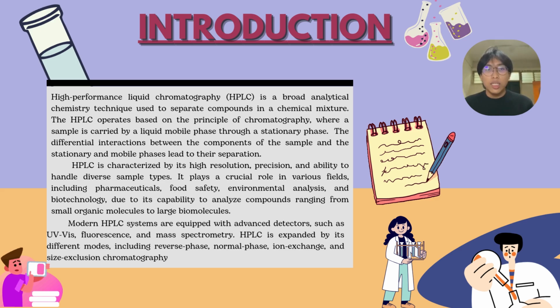Modern HPLC systems are equipped with advanced detectors such as UV-Vis, fluorescence, and mass spectrometry, which enhance the detection and quantification of analytes. HPLC is expanded by its different modes, including reverse phase, normal phase, ion exchange, and size exclusion.